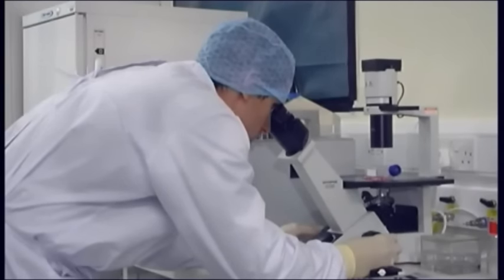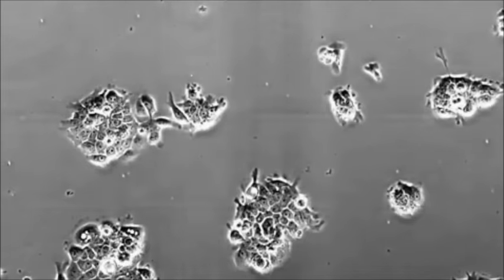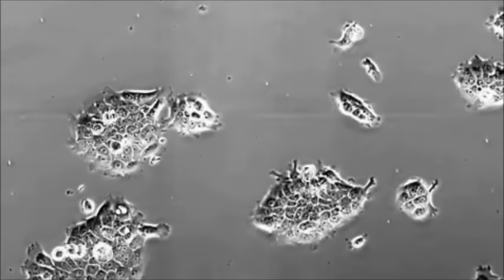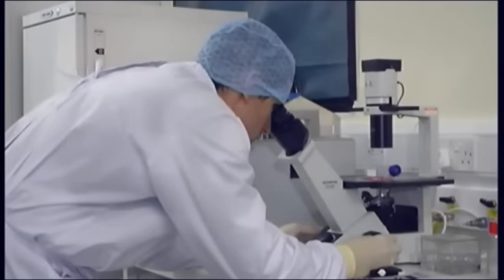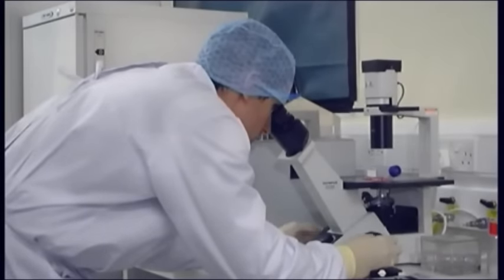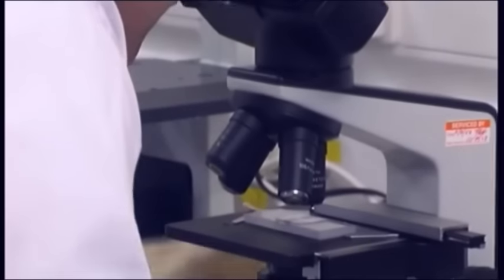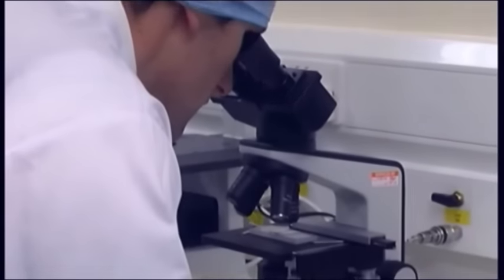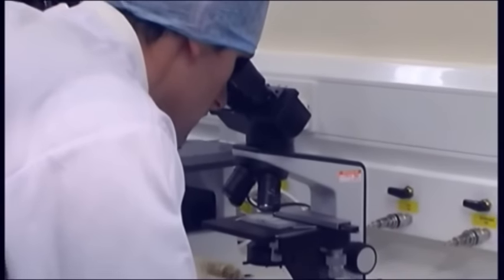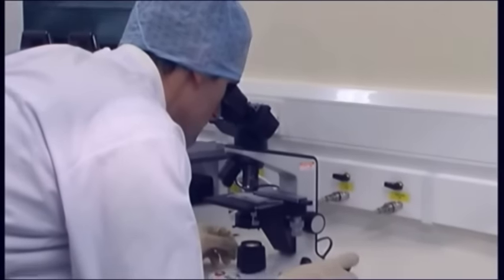Microscopes: Regular monitoring of cell cultures is essential, as it will provide a lot of information regarding cell growth and general health of cultures. In order to do this, a properly set up inverted phase microscope is required. A standard light microscope is also useful for applications such as cell counting, as we will see later. Microscopes are precision instruments and should be well looked after. Always turn off and cover when not in use.